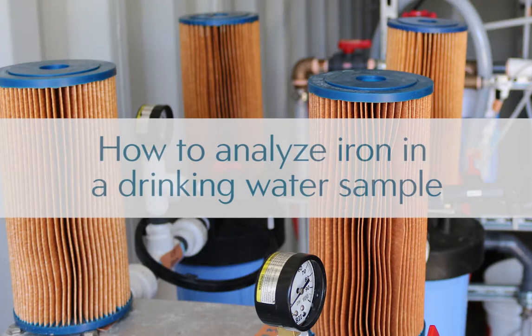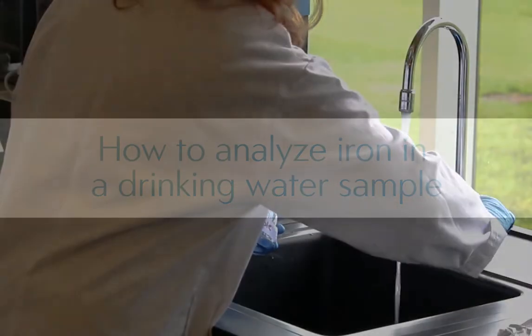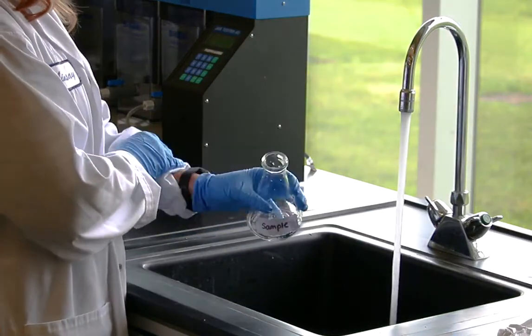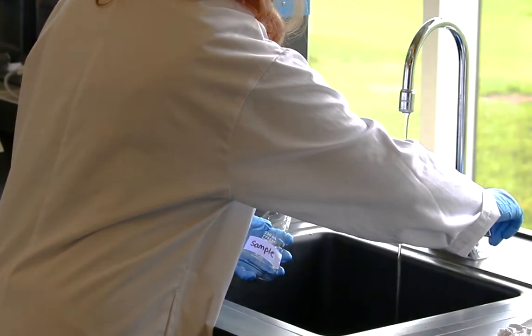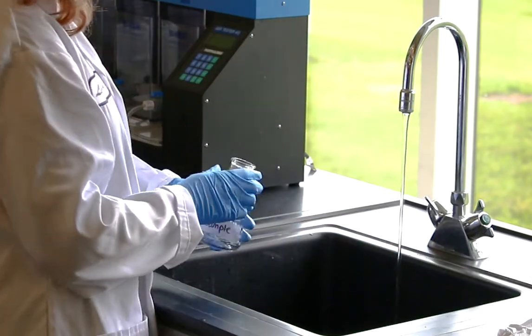This video will demonstrate how to measure iron in drinking water using the USEPA Ferravera method. This is a basic procedure overview and should not replace or overrule the instructions provided to you by your instrument manufacturer.